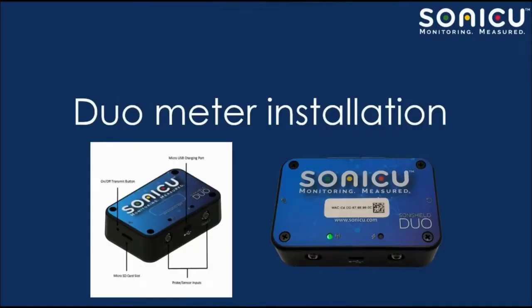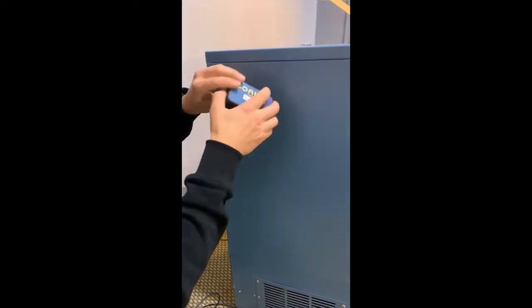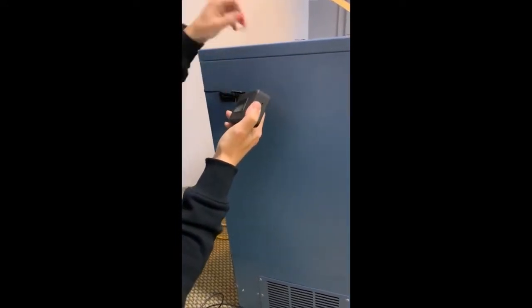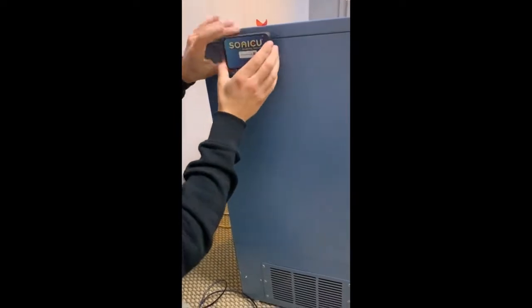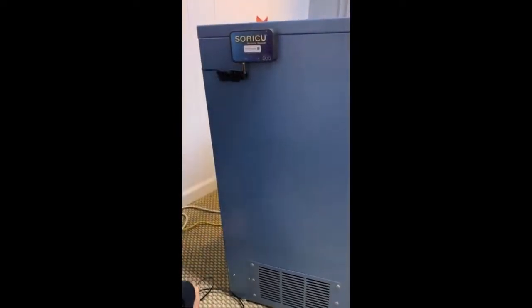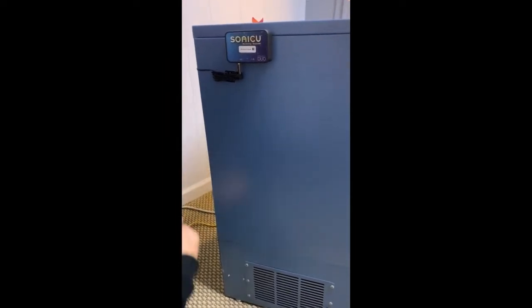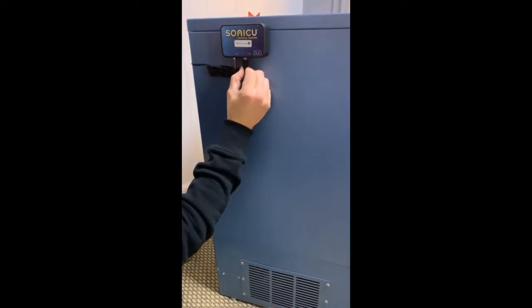Duo meter installation is just as easy. Peel off the red adhesive backing on the meter, insert your Sonic U sensor into the desired input on the underside of your SoniShield Duo, and place the meter in your desired location — typically attached to the side of the appliance. Plug the power cable into the meter and plug it in to receive power.